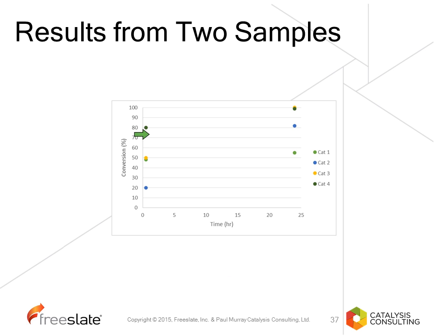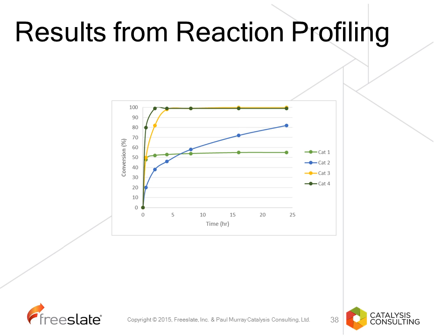If, having run the same reactions, we take some more samples, we actually get a true profile for these reactions. And the difference from a point of view of taking this chemistry forward is that Catalyst 4 has a cost of about $10,000 a kilo. Catalyst 3 has a cost of $5,000 a kilo.